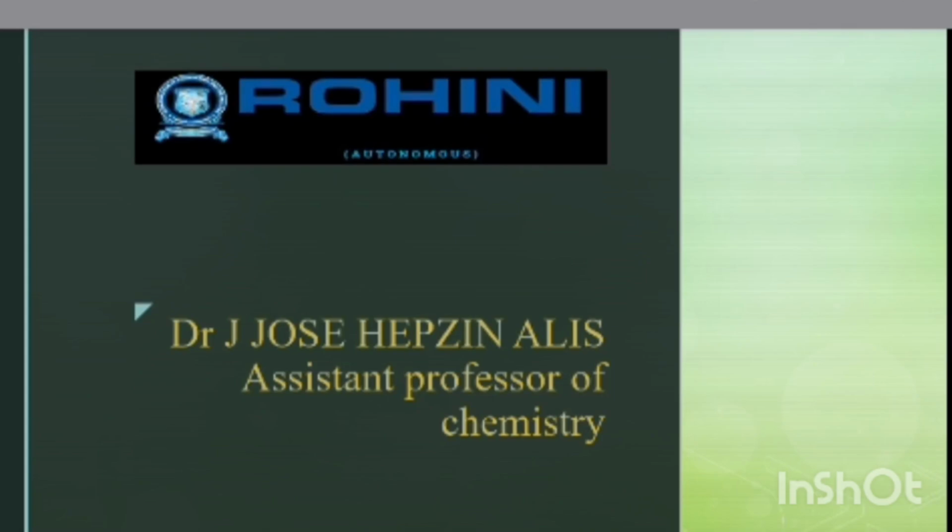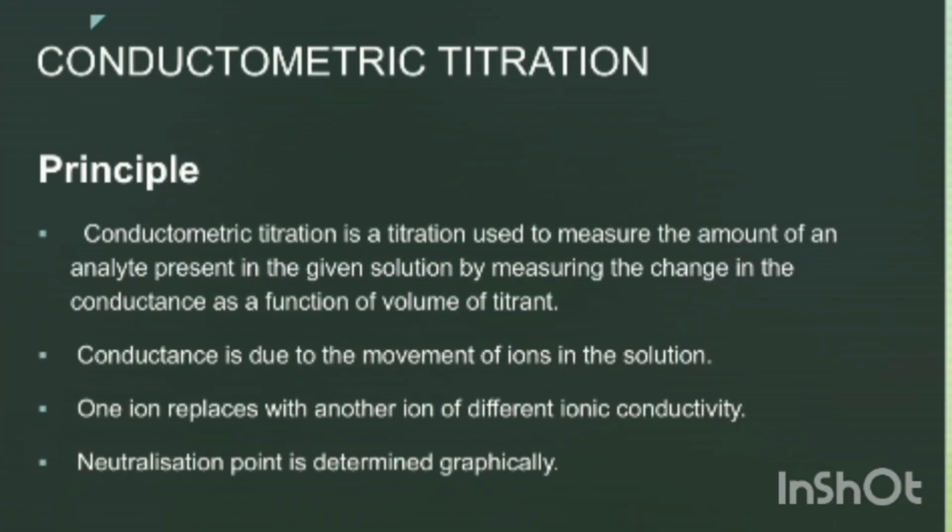I am going to teach you conductometry titration. We look into the principle. Conductometry titration is a titration used to measure the amount of an analyte present in a given solution by measuring the change in the conductance as a function of volume of titrant.